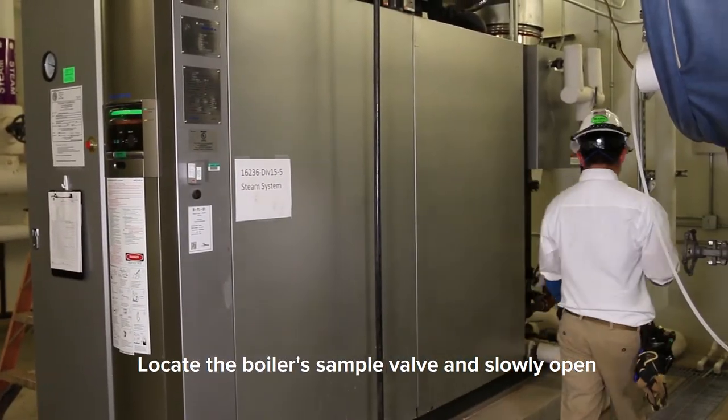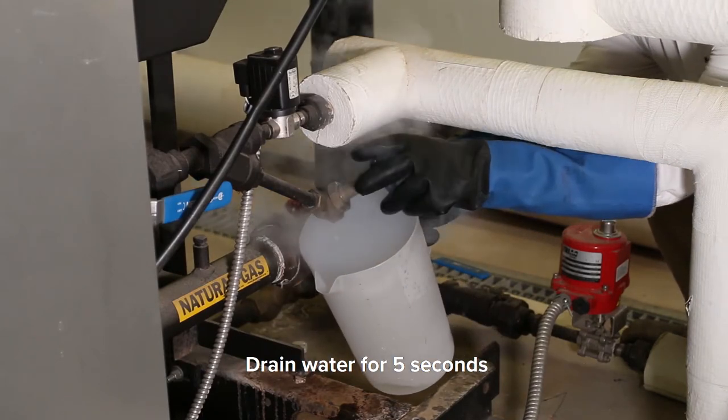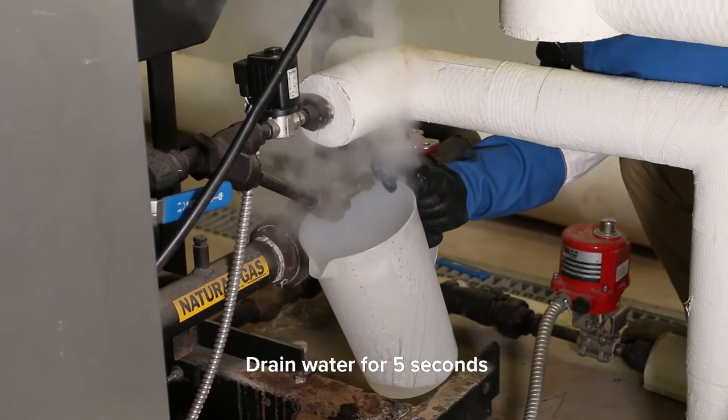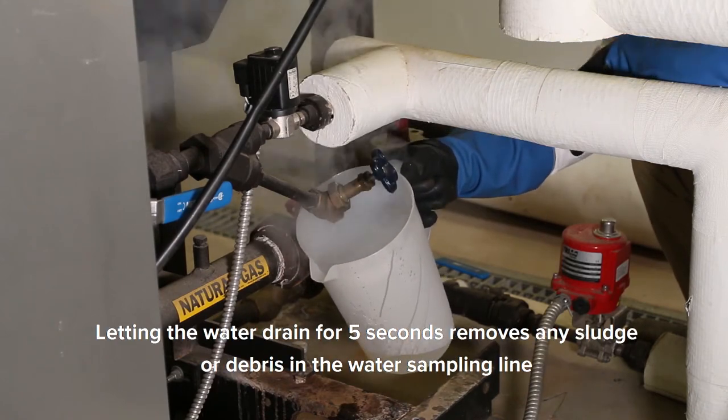Locate the boiler's sample valve and slowly open. Drain water for 5 seconds. Letting the water drain for 5 seconds removes any sludge or debris in the water sampling line.